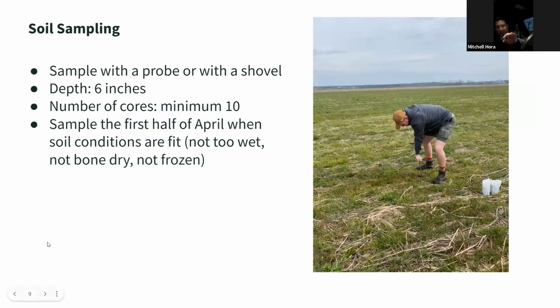So the key, one last thing with that one is, draw the project field boundary to encompass the area that you are interested in testing. Then when you're actually out there in the field, or when you're preparing to go do the samples, you don't have to do it on the exact day that you sample, but we want to know exactly where the sample was taken.